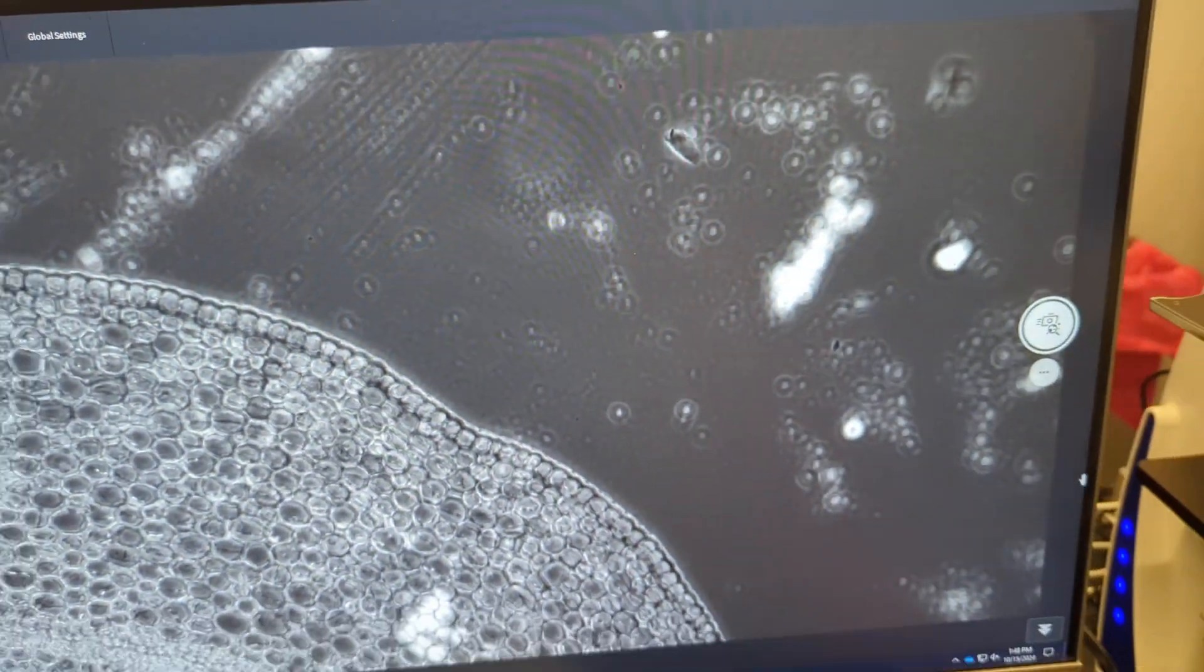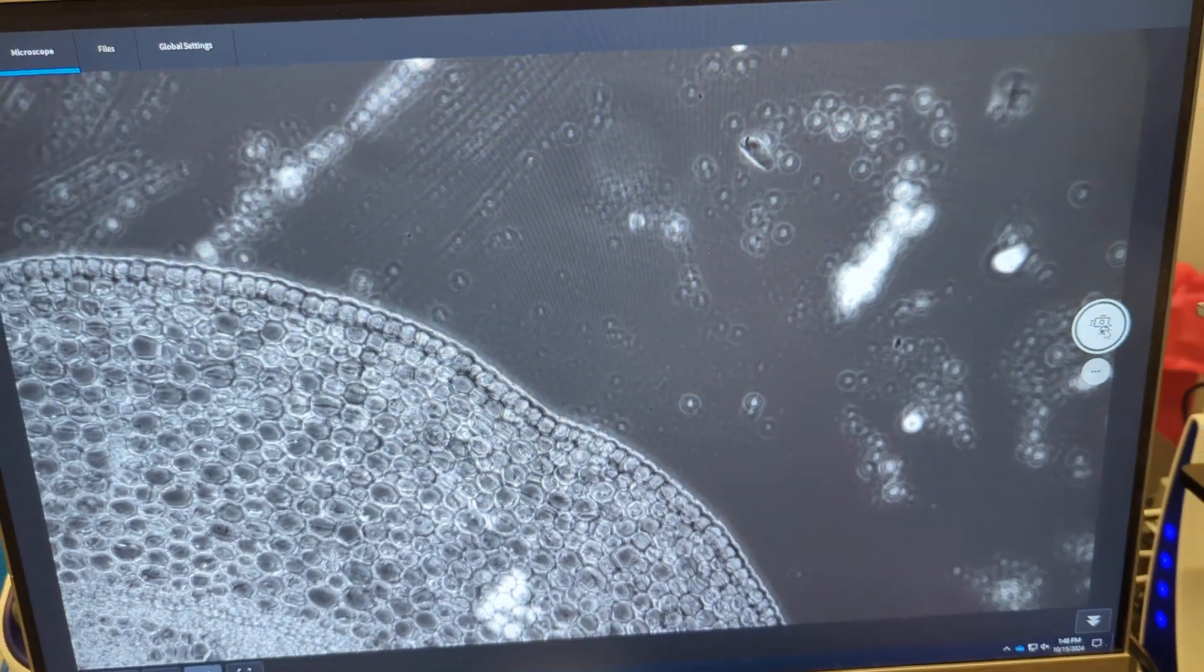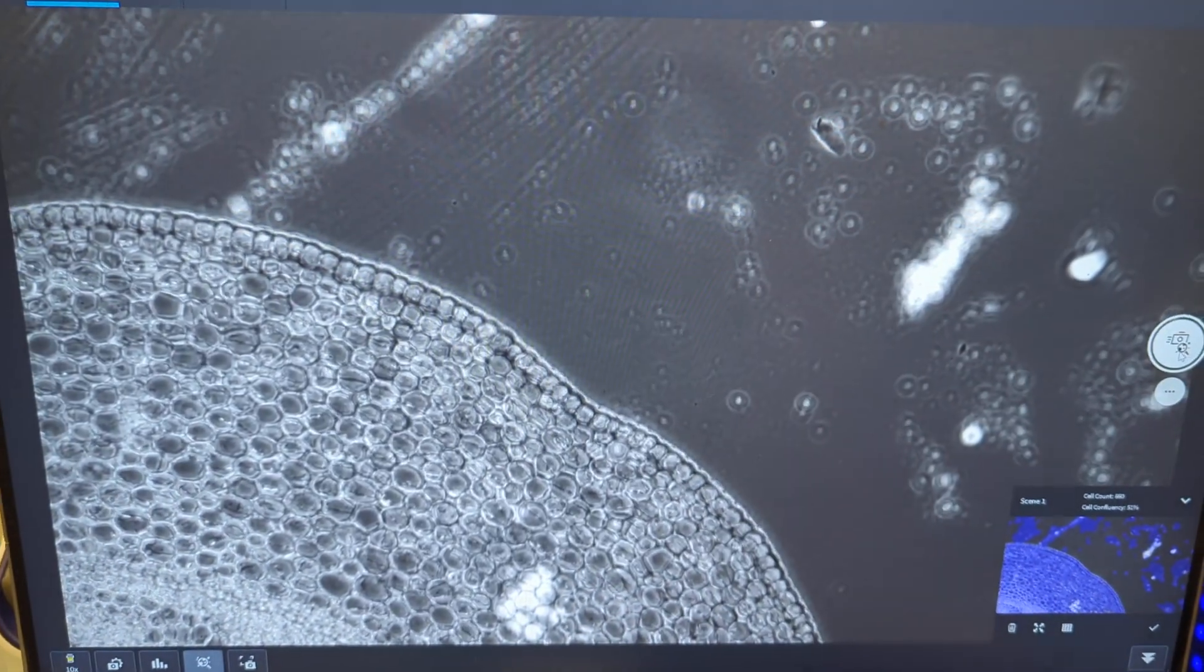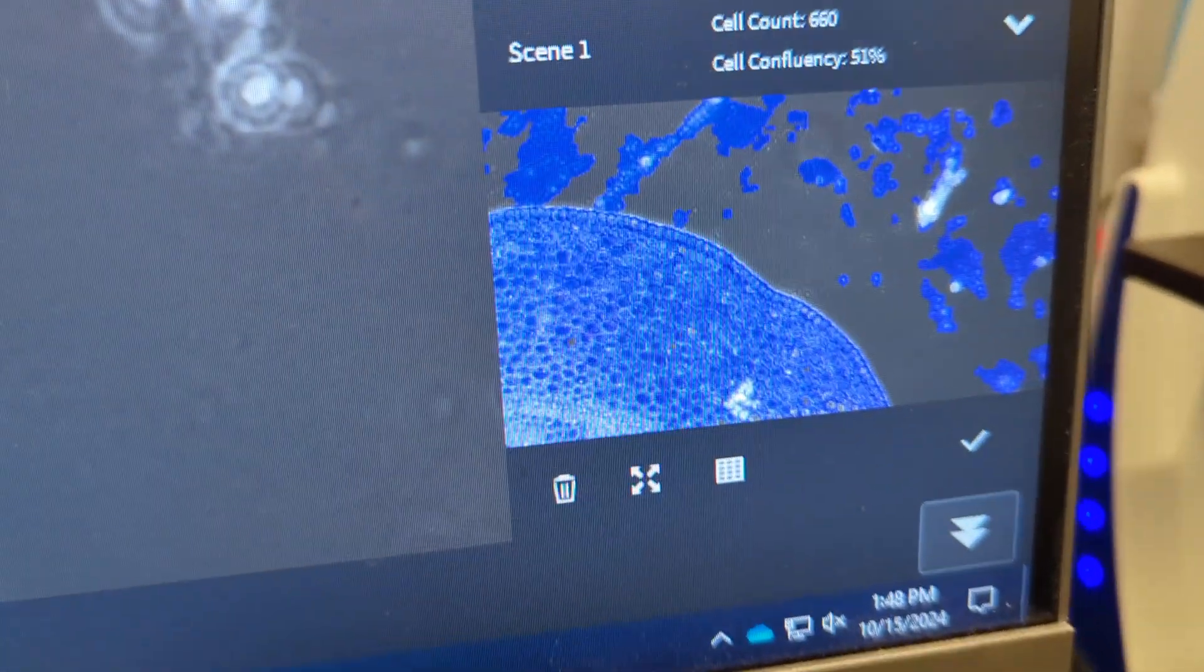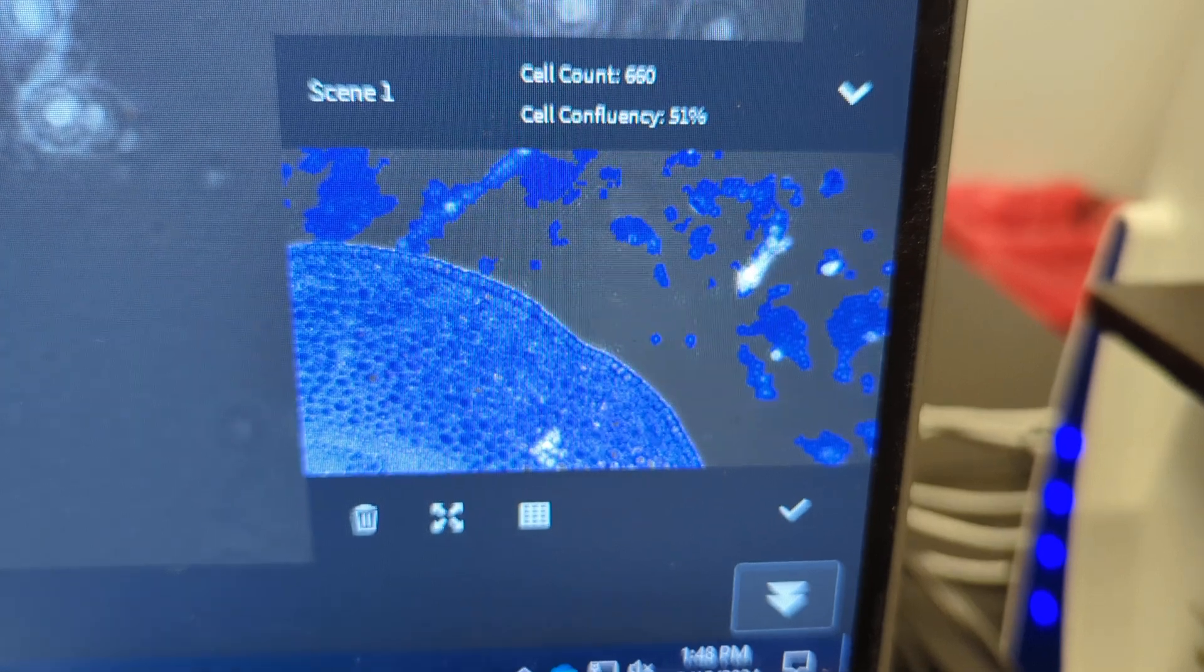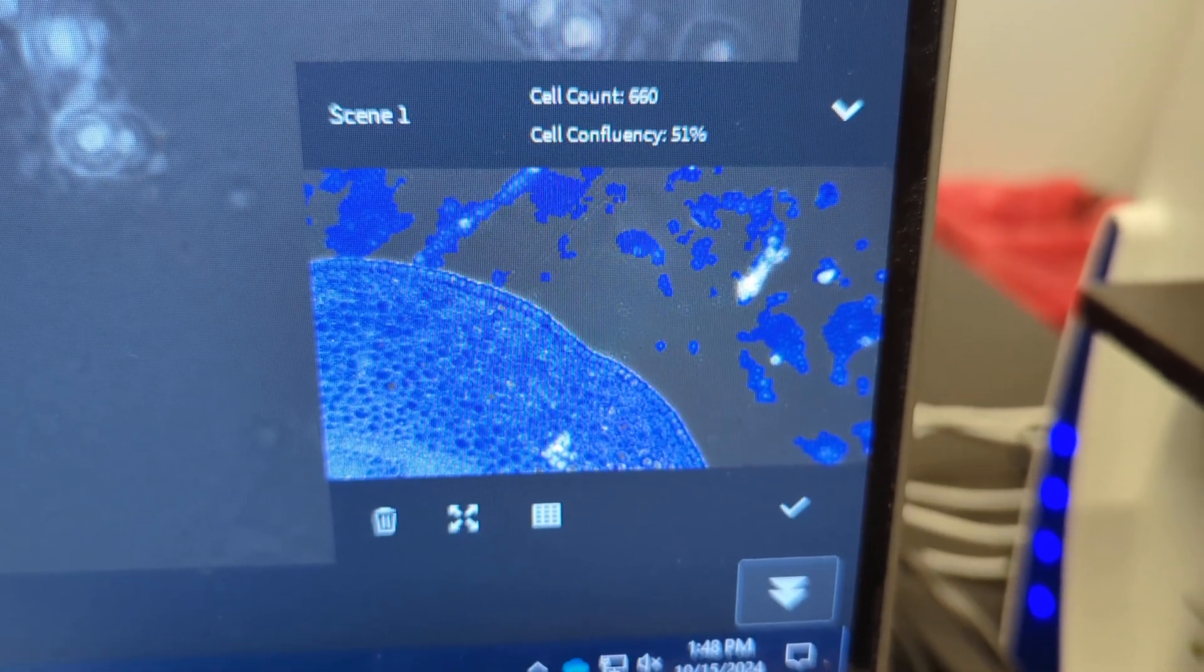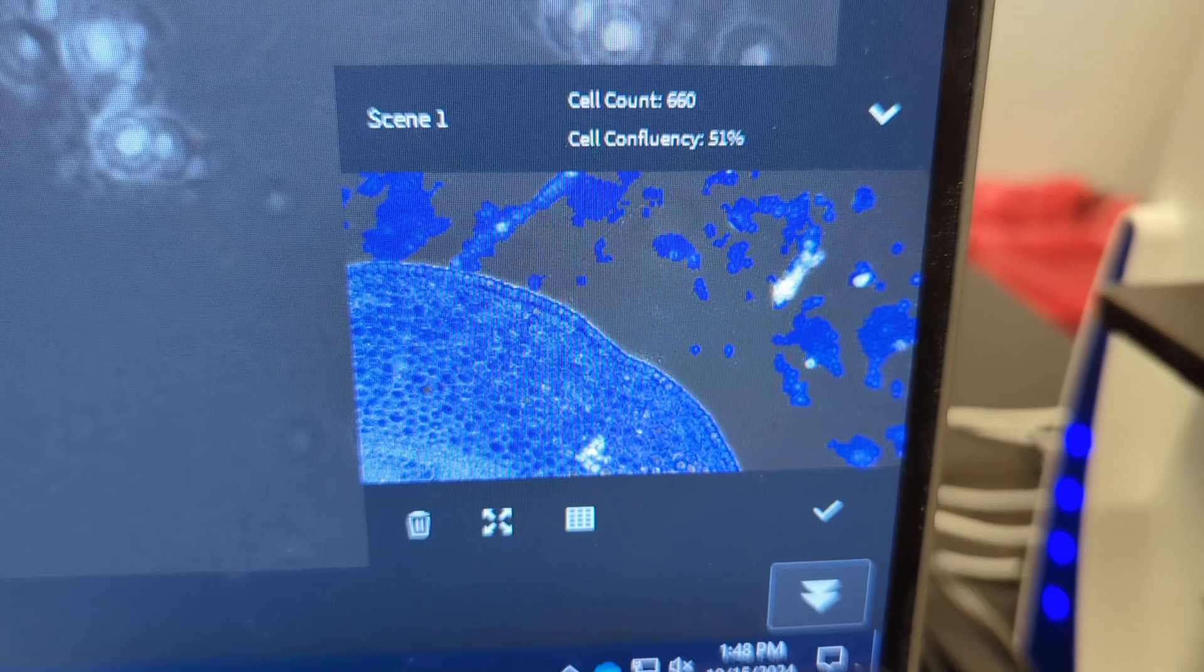So now we're active, I'm going to click the count button for the first image. So now it's calculating the cell confluency, and it did the count. And you'll see down at the bottom here, it gives you scene one. That's my first image, and the results of that. Cell count, 60, and 51% confluency.